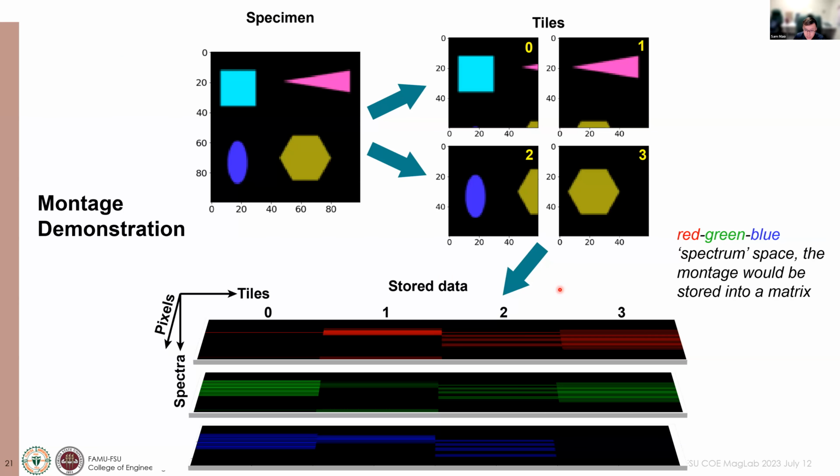Yeah, and then the last part I want to cover is a trend with all these microscopy companies. They develop these products that are able to help us do the montage and automatic imaging. So for example, these are like 3 layers. What you are usually doing is storing all these XY positions, and then you are going to store whatever spectrum data you want to acquire.